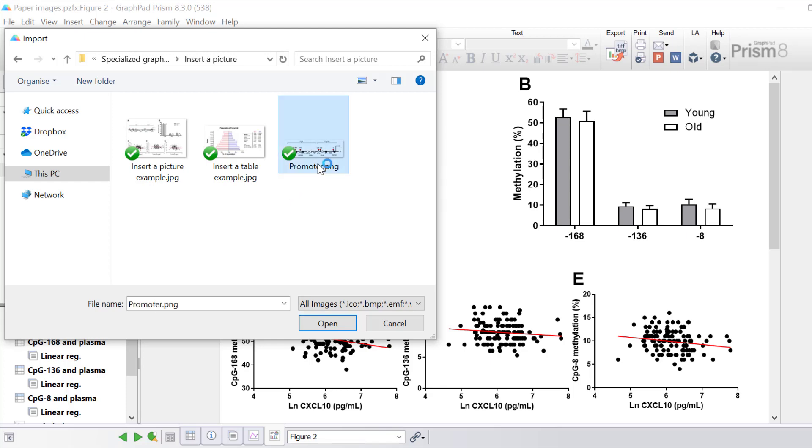I'll insert this promoter region schematic that I have prepared earlier which is a PNG file and then click open.